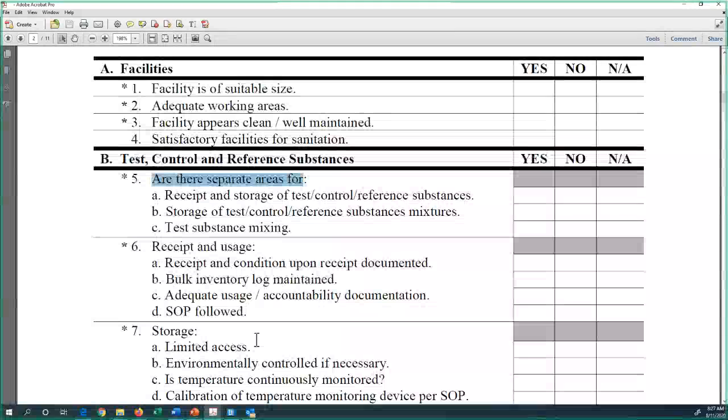Otherwise, because it's very easy to contaminate, and this is 100% or nearly 100%. Even a little bit, even if the wind blows a little bit, it's going to mess up the whole system. You know, LC-MS/MS is very, very sensitive.